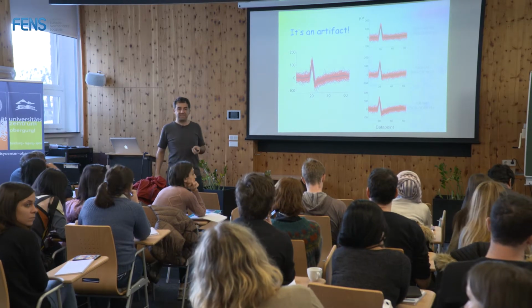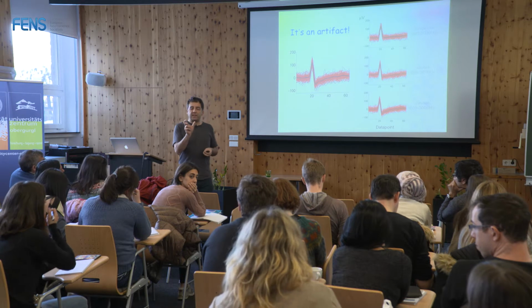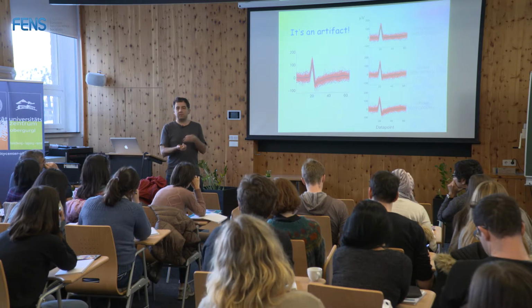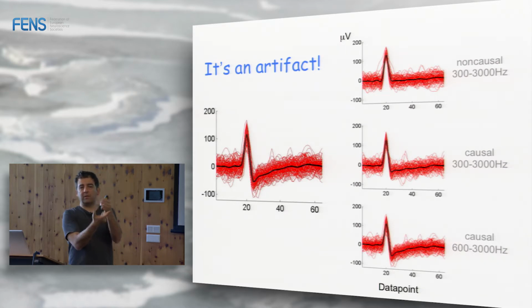So when you talk about using a non-causal filter, does that mean that you use it offline? Offline, yeah. There's a way to do it online, which I propose, but we have to convince the people building the system. You can have a little buffer. So technically, you won't be online, but you can be delayed. You can be lagging by, say, 500 milliseconds or so. And then you can record data and filter it with a little delay.